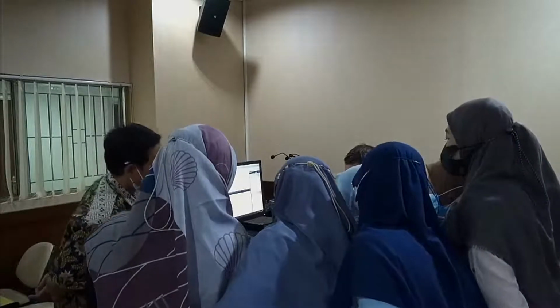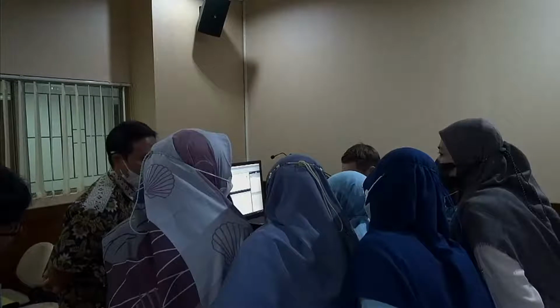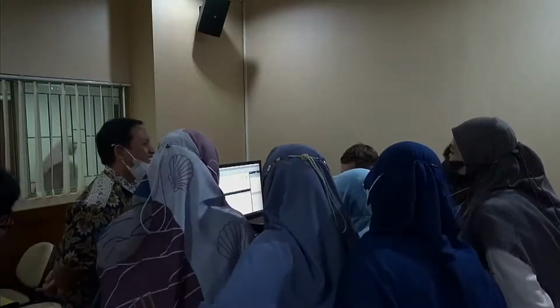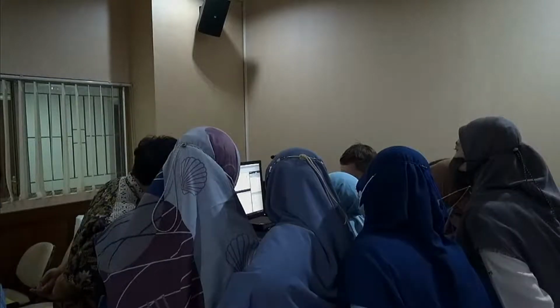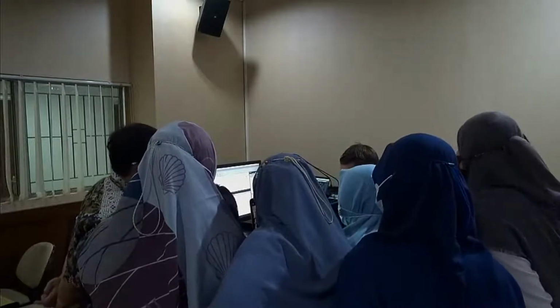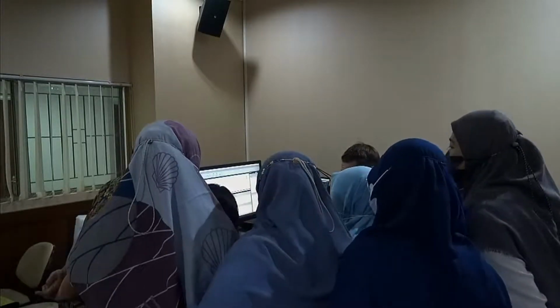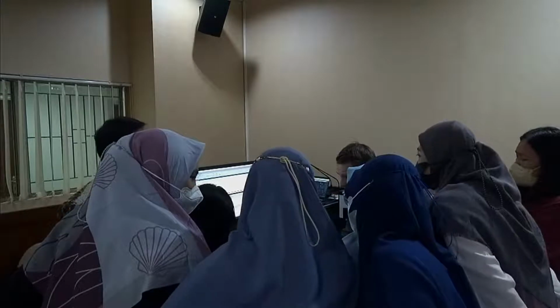So that's our result. 3 consecutive measurements. The goal of consecutive measurements is to make sure you have a stable dispersion. I would say we have a very stable dispersion. As you see, they are all exactly the same. We can also check this in values. If we simply add a percentage chart, 10, 50, and 90%, you see the difference is rather small.